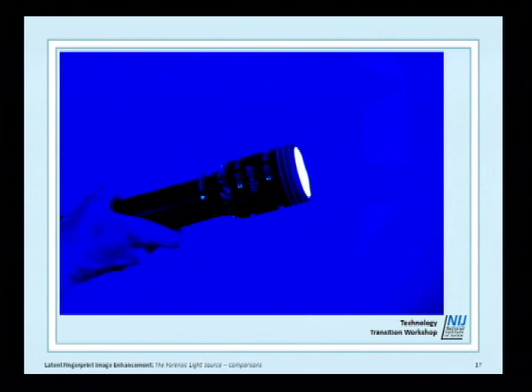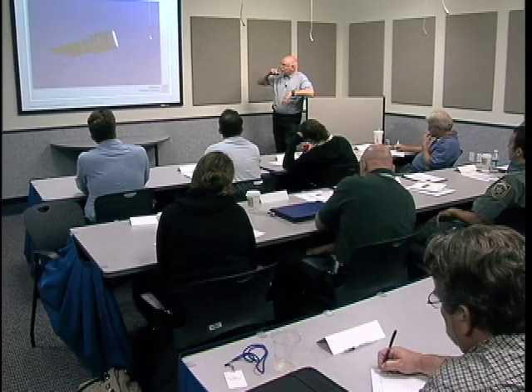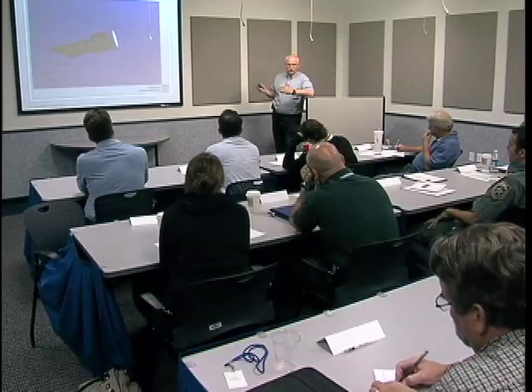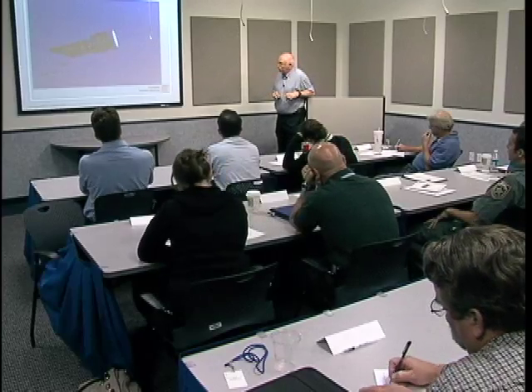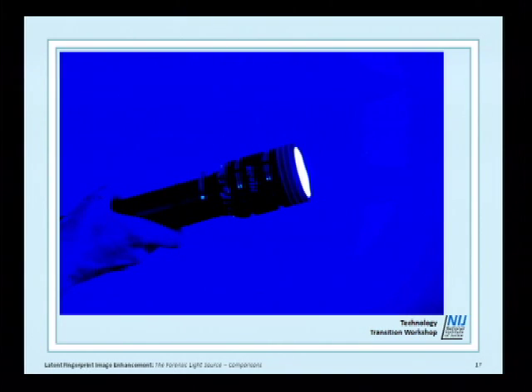And the LEDs are similar in technology to the semiconductor laser in that the light produced is a result of electrons moving in semiconductor material. And as a result of that, it can be engineered as well. So it opened up a whole new area in terms of developing light sources that were cool, robust, fairly cheap, and very, very long lasting.